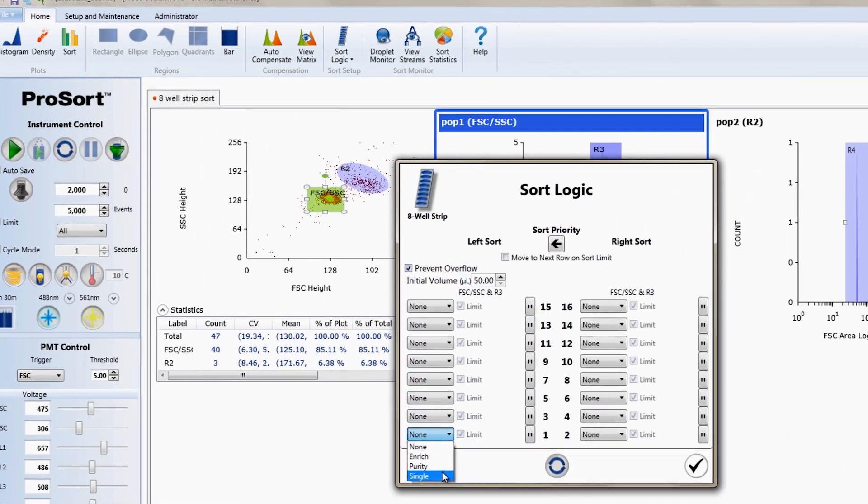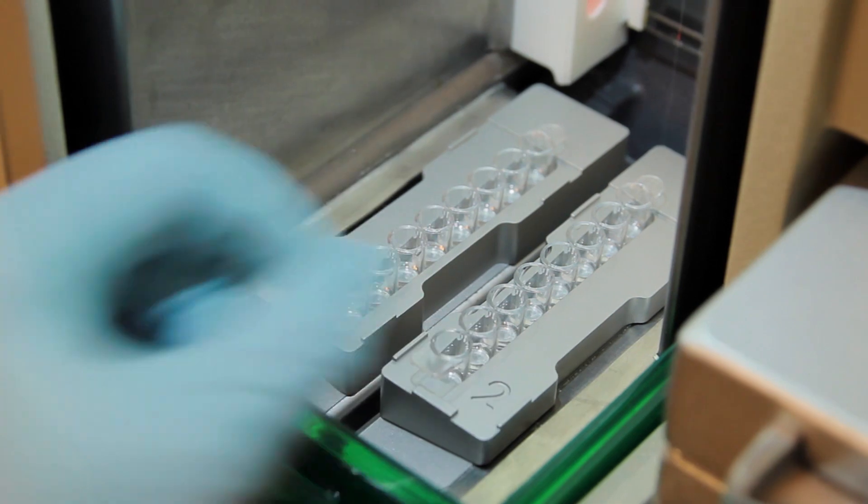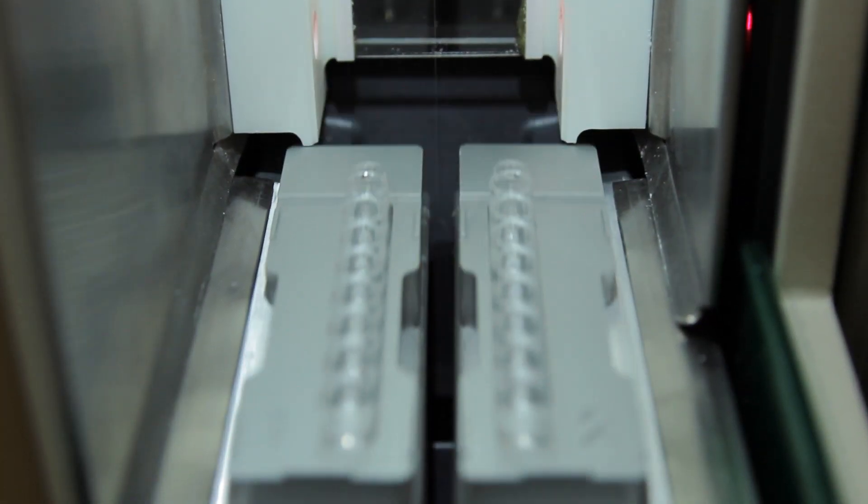ProSort software has preset logic that allows you to effortlessly sort into eight-well strips. Sort two strips at a time and build your 96-well plate in less than two minutes.